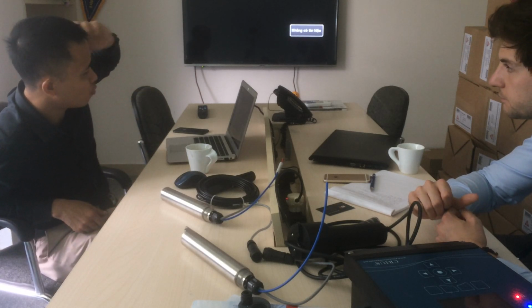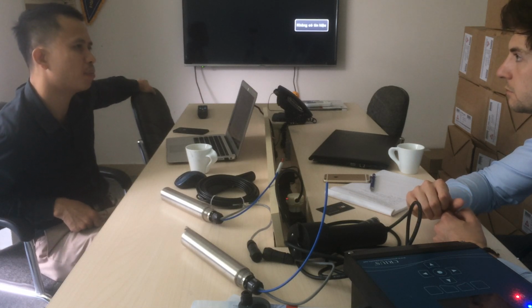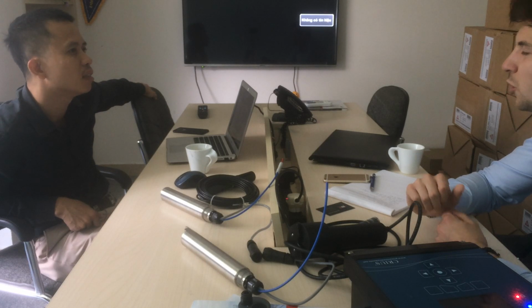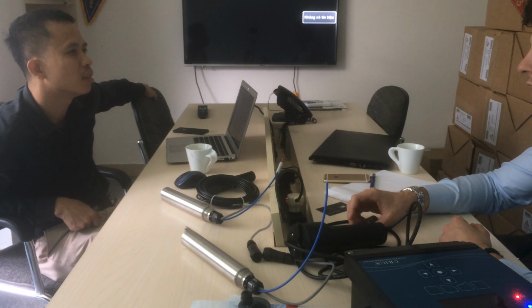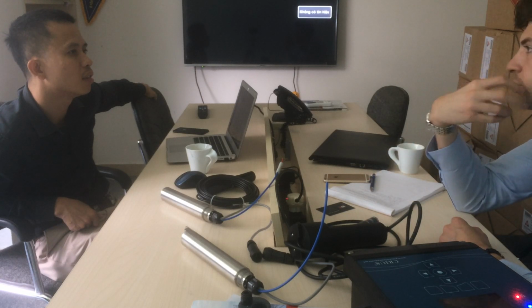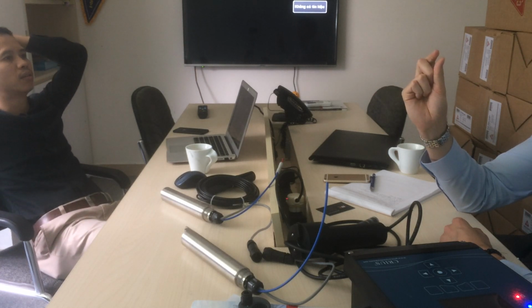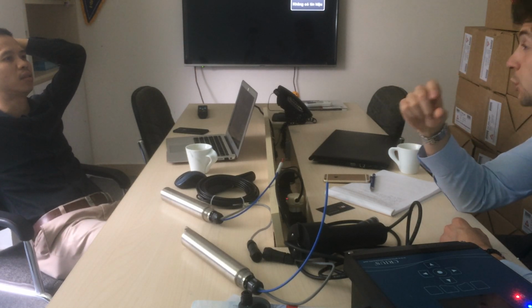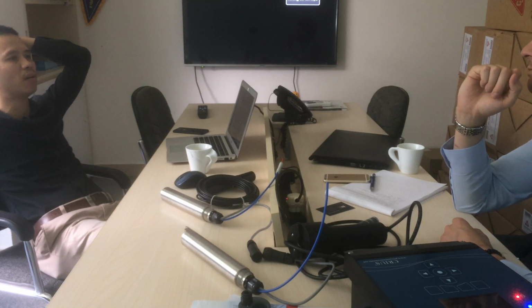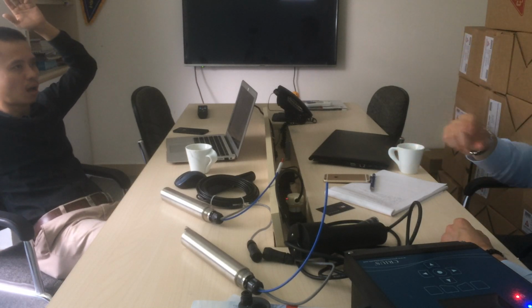So I see your product has a particle sensor. Yep. So should we apply the particle sensor instead of the turbidity or the TSS? Normally the particle sensor is for after filters, to monitor if there's any breakthrough of bacteria through the filters. The particle sensors count individual particles, and they can also measure the size of the particle. Yes, we have the size ranges.